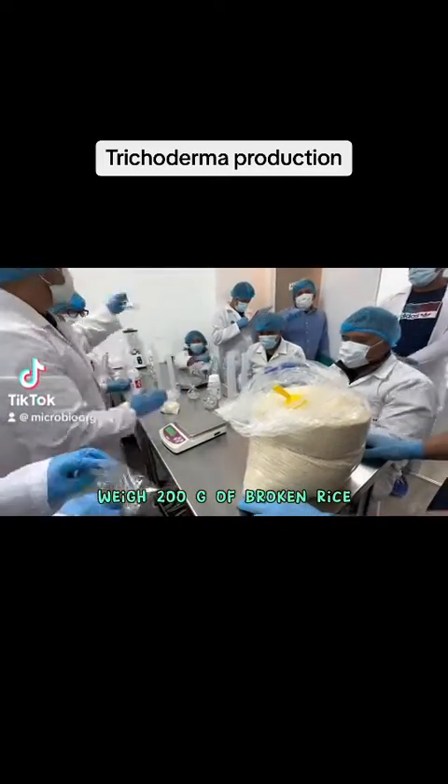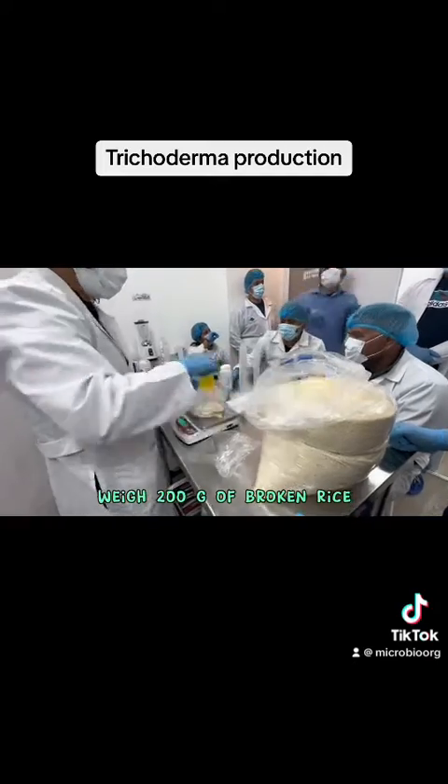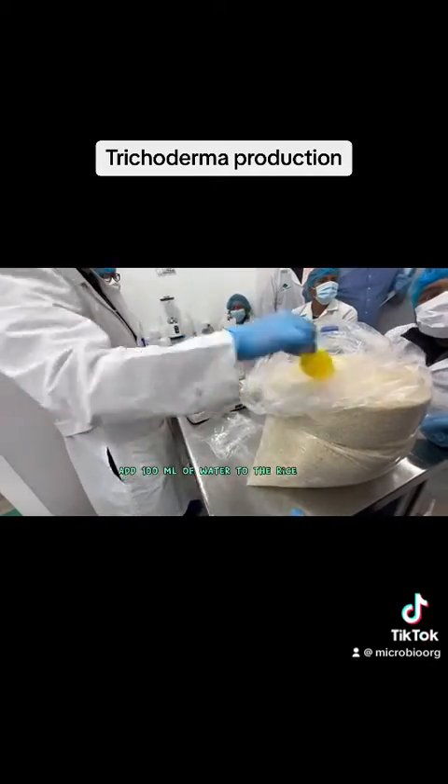Weigh 200 grams of broken rice and autoclave at 121°C for 15 minutes. Then add 100 milliliters of water to the rice.